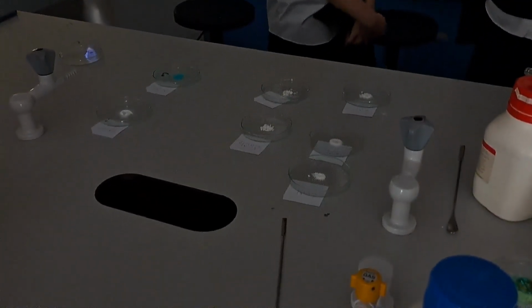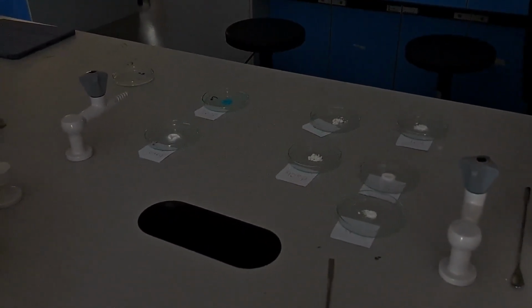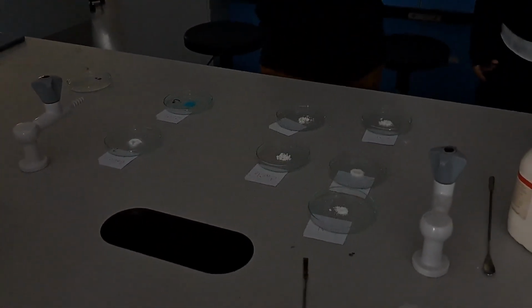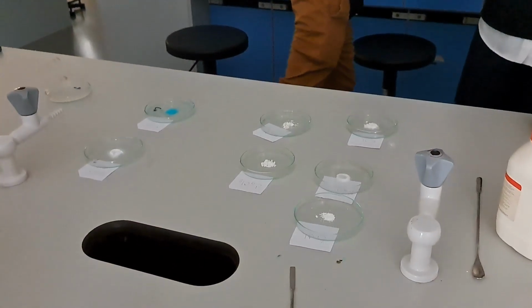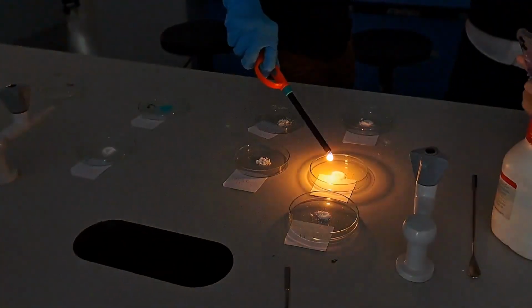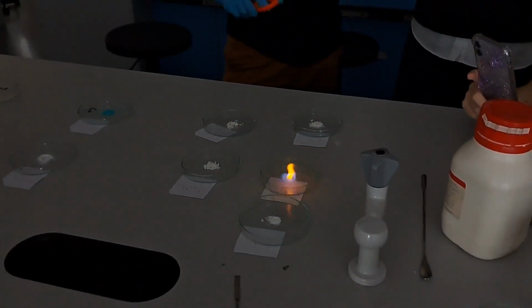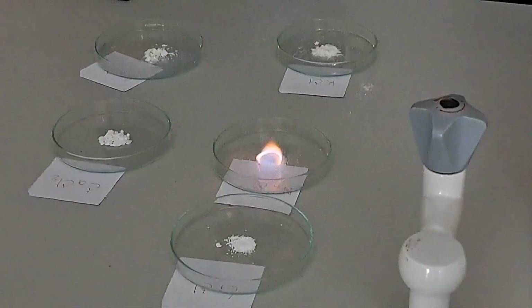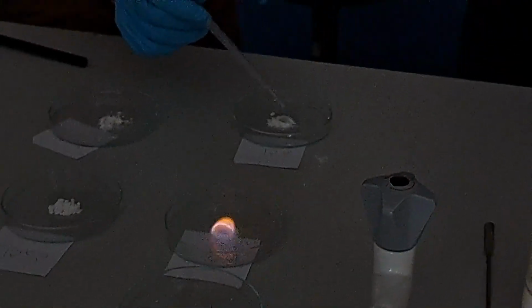Okay, that's going to be a yellow flash. Sometimes when you look at the tip of the flame, it's a yellow flash. That is the color of the element when it burns. What are you dropping? Ethanol. Okay. See the yellow flash? It's more yellow than normal.